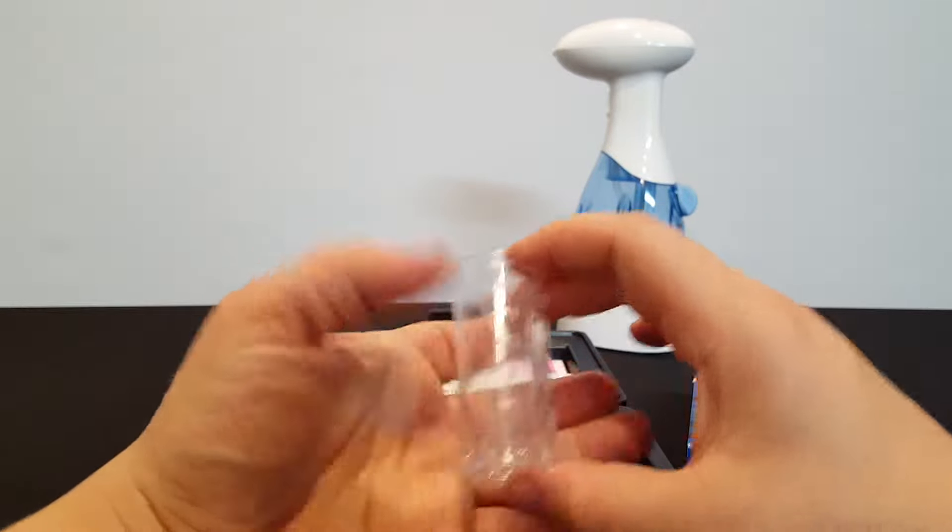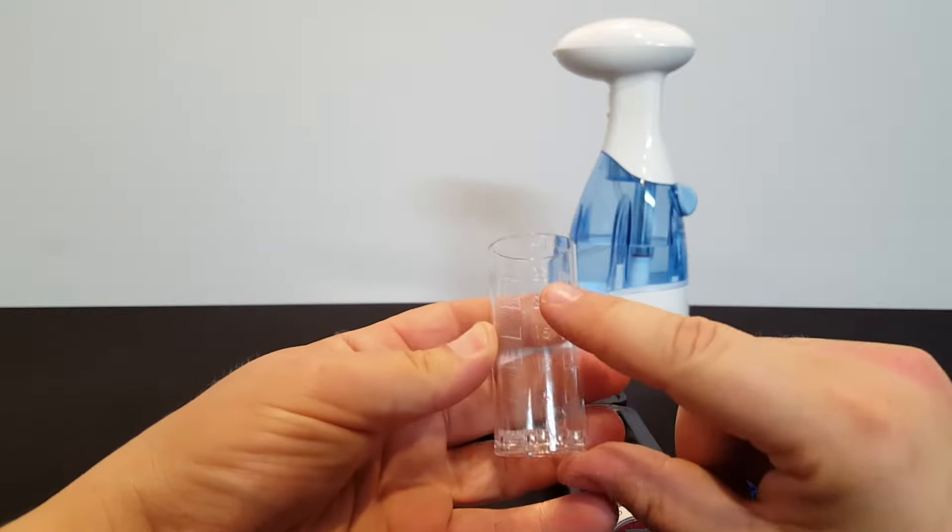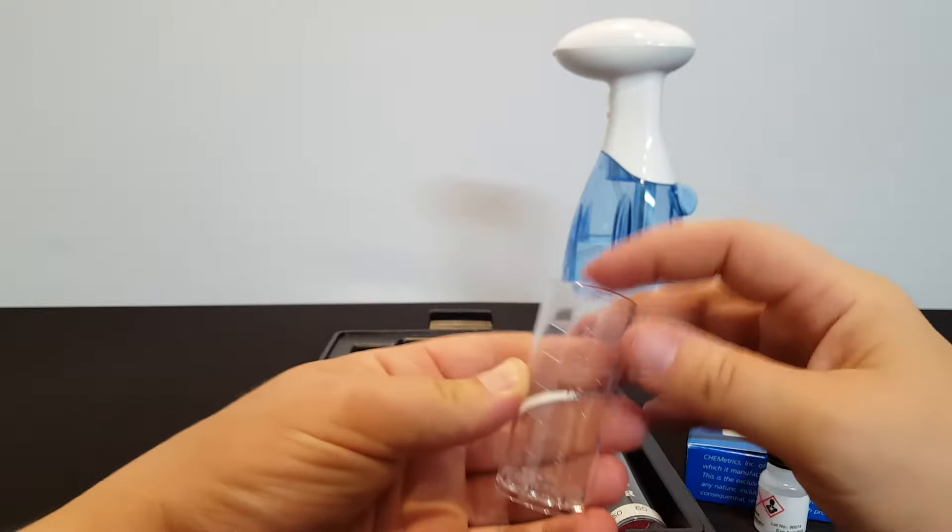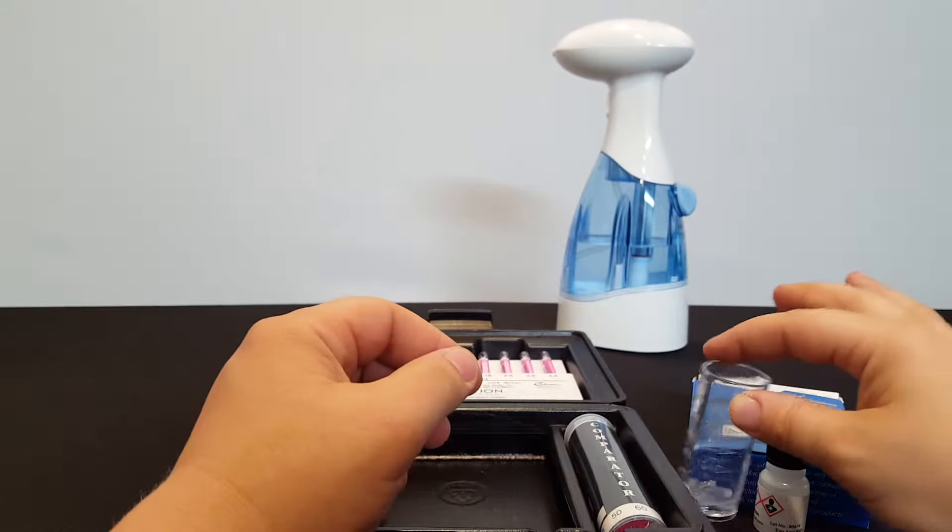This is the test cup. It goes up to 25 milliliters. This of course is reusable.